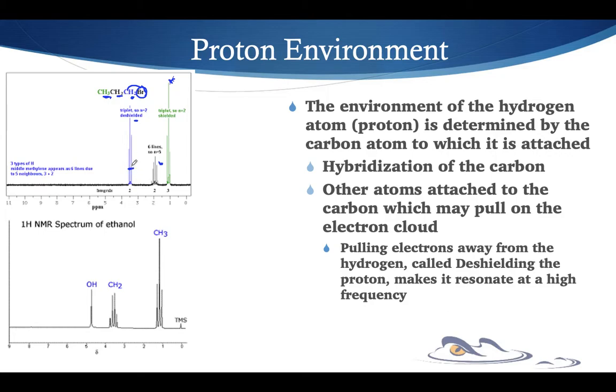See, these ones here are vibrating faster. The signal that you see down here is backwards. Do you notice that? Here's 0 over here, and there's 11 over there. So the signal is actually backwards. And the faster it's vibrating, the more to the left that is going to appear.